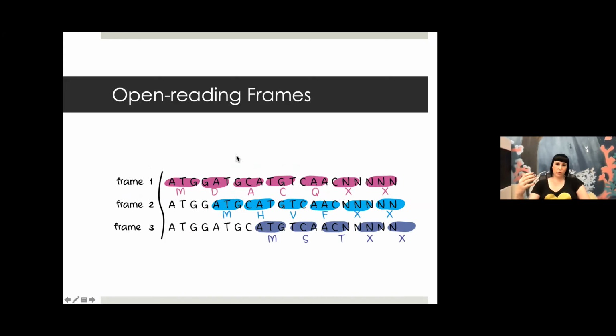Because codons are composed of nucleotide triplets, there are 3 frames to look through to find potential genes. The amino acid completely changes just by shifting 1 base. Additionally, there are 3 more frames in the reverse direction, which I don't really show here.